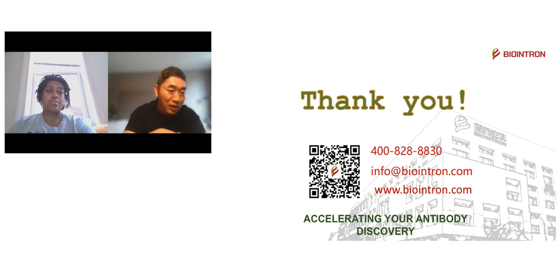Let's go back to the question itself. Why do we use mouse as the benchmark? Because in that case, our customer wanted to raise antibody from rabbit for advanced functional requirements, or for the antibody to recognize some tricky hidden epitope. But a rabbit antibody as a benchmark or positive control is not available. So the way we can get one is from mouse. Actually, the reason is simple.